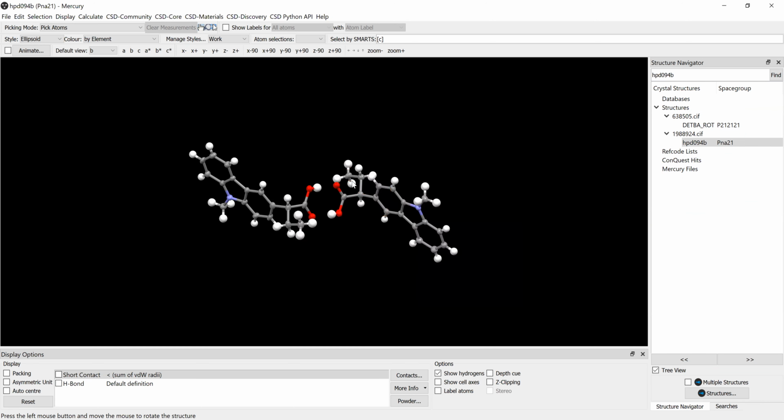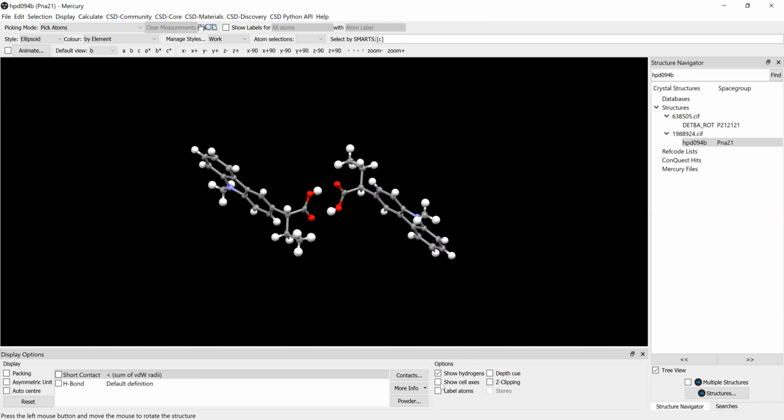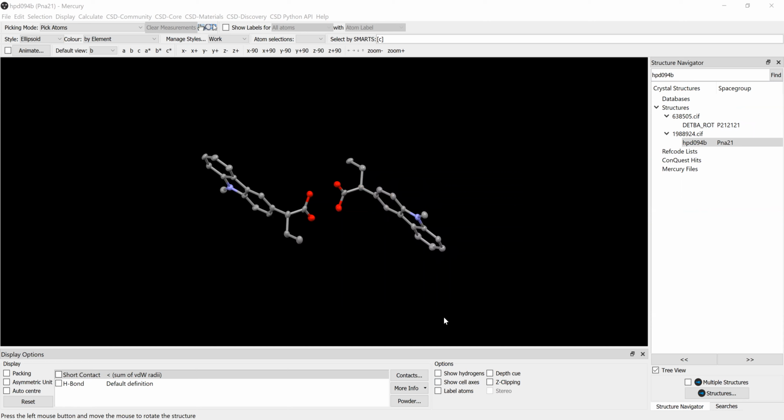So now if we want to draw the unit cell, and if the hydrogens look like they're going to be kind of messy and hard to help you illustrate, you can turn off the hydrogens like that. For the crystallographic axes ABC, A refers to the fractional coordinate for X, B refers to the fractional coordinate for Y, and C relates to the fractional coordinates for Z. And that's how you can relate ABC, XYZ.